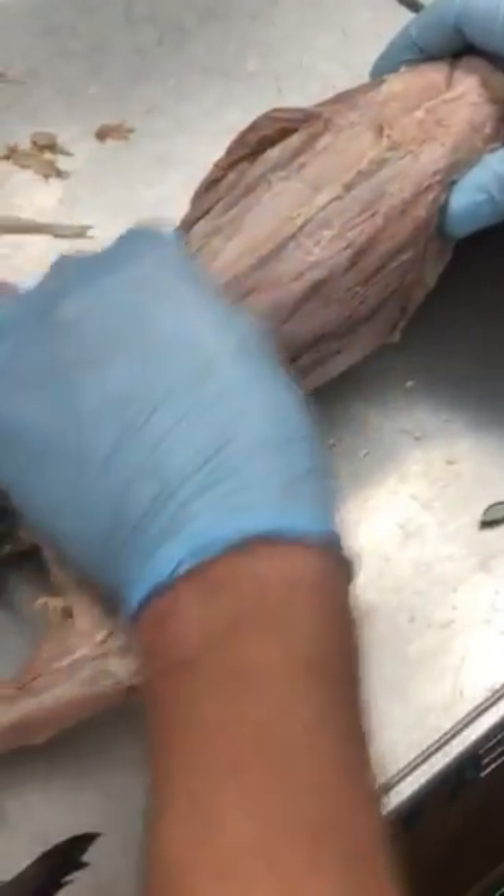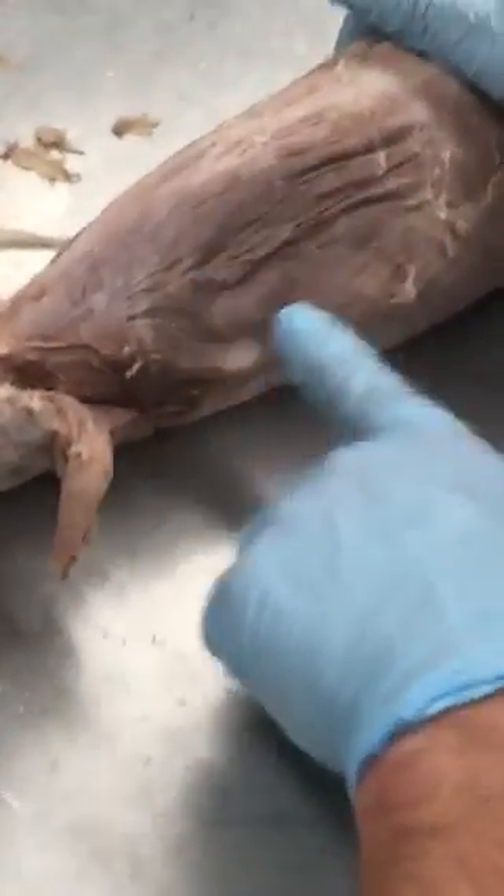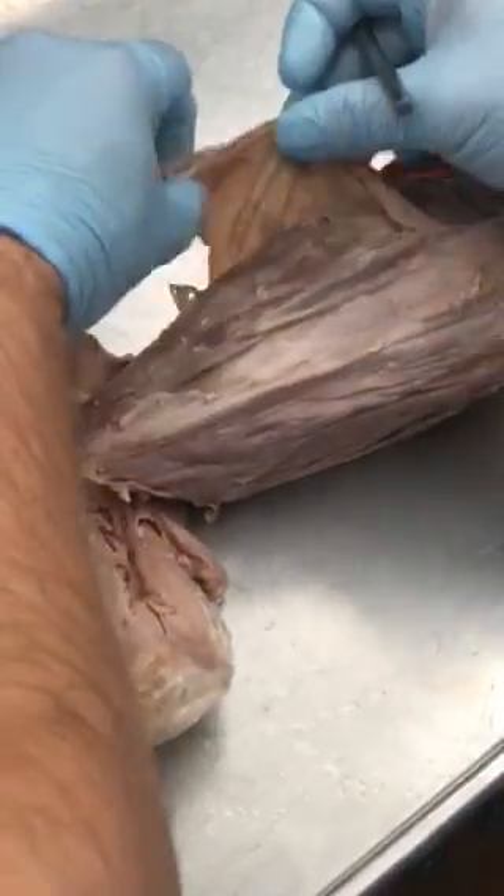There is the rectus abdominis down the middle here, right where you see all this white stuff. Now on this side, you can see right there, that's the external oblique, right there. This is what I deflected on this side — that's the external oblique.